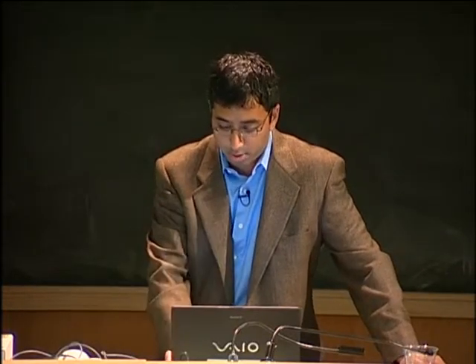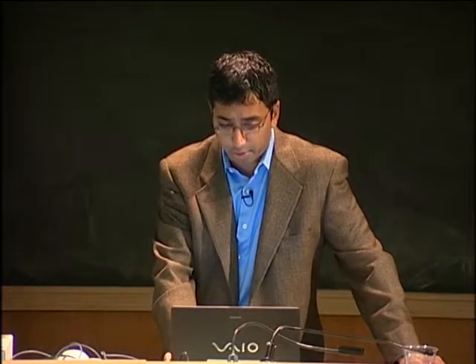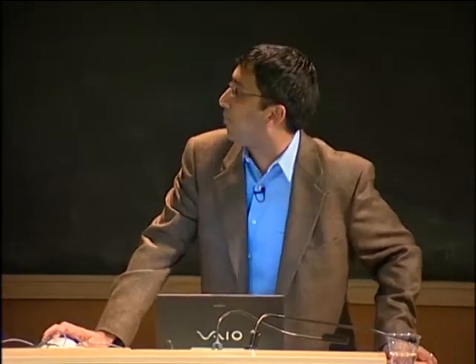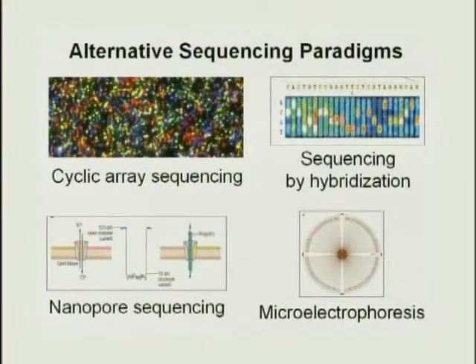And so that spurred a number of groups, including the lab where I was in graduate school, George Church's lab, to think about alternative approaches to DNA sequencing. Some of the ideas that have been bandied about since the 80s, or since the early days of sequencing, include 4 that I'm showing up here. One is nanopore sequencing. The basic idea here is to drag DNA molecules through biological or synthetic pores and look at perturbations in current as a way of figuring out what the sequence is.